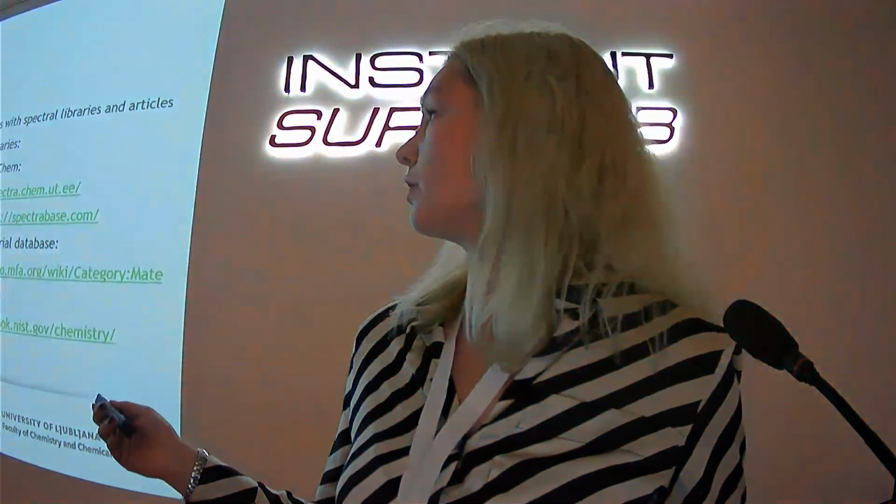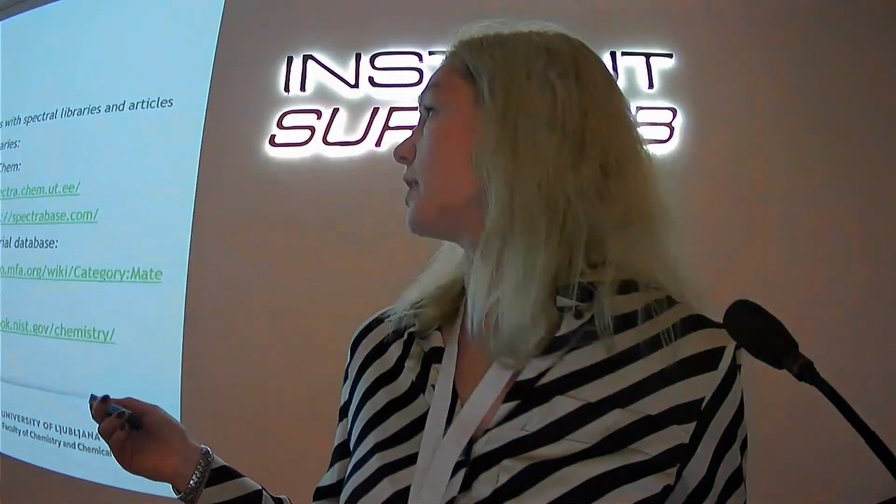With the chemical characterization, of course, you can use different methods. We heard a lot of them already today, so maybe I will skip this part. We are usually using FTIR for the chemical characterization. Usually, if you have the machine, you also get some libraries from the producer. But there are also some free libraries available that you can use if you don't have access to other libraries, and of course also the articles.